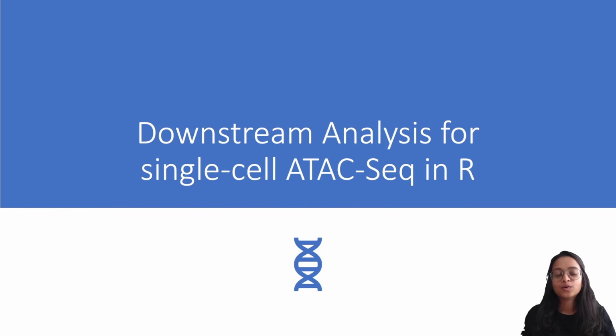So in this video, we are going to continue the discussion from the previous video, where we learned about what single cell ATAC-Seq data is, how we process it, and how we interpret it. Today I'm going to continue with the same data, and we are going to learn how to perform some downstream analysis on the pre-processed single cell ATAC-Seq data.